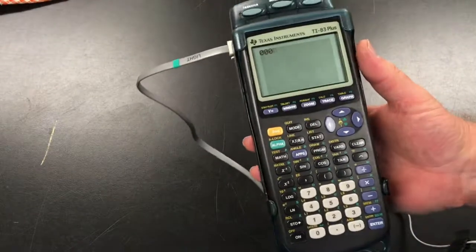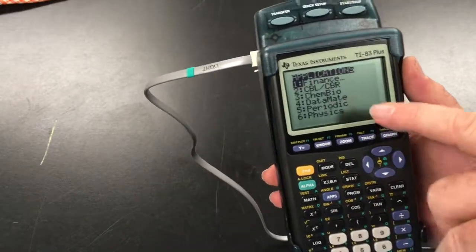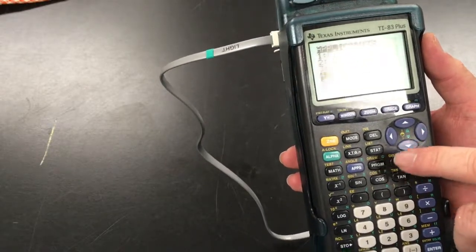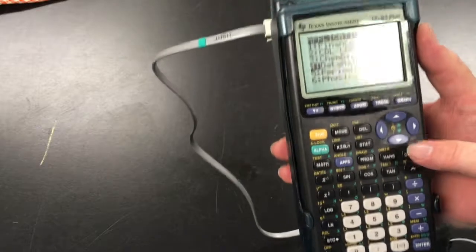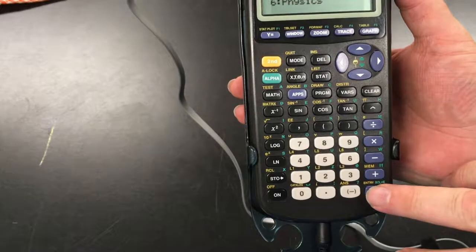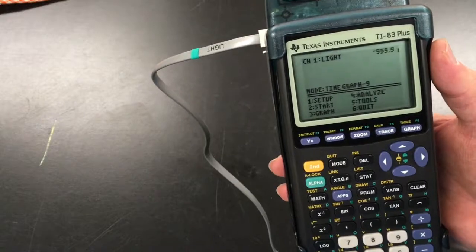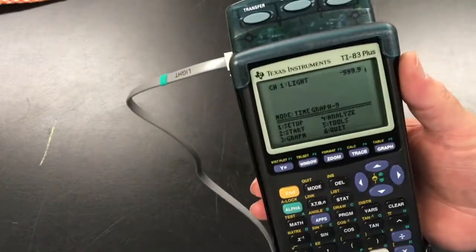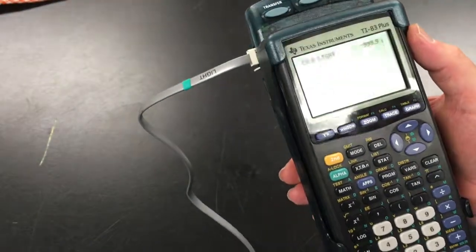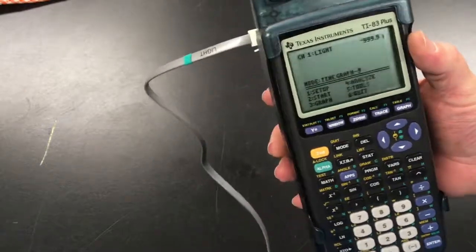Now, in this one we've got apps, so we want to press apps, and we want the one that says data mate. So we go down to 4, or you can just press 4 on the calculator. Once you're at the right one you want, you just press the enter key down here, same as a normal computer, and it starts loading the software. And here you can see it's detected the probe at the top, and it's giving you a readout in lux, and it says a reading that it shouldn't say, so we have to reset this computer.